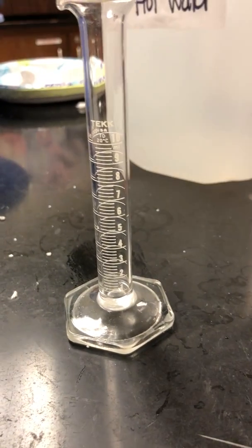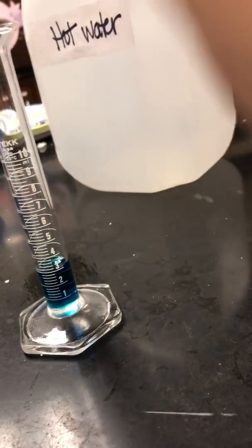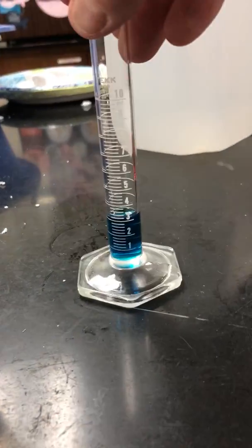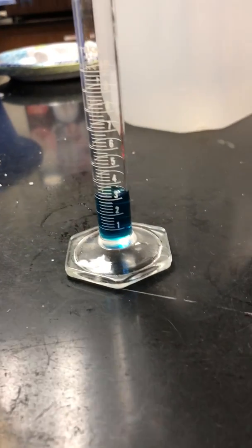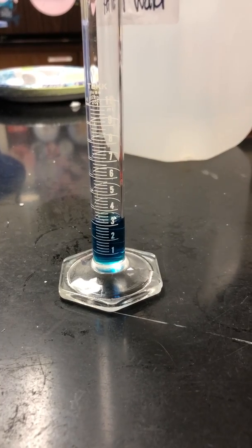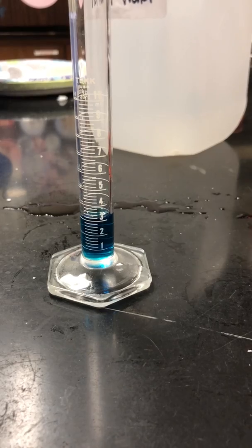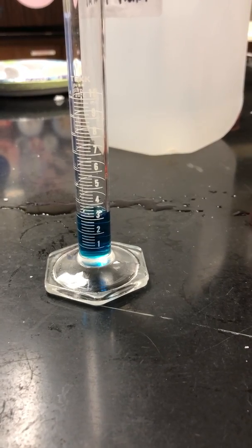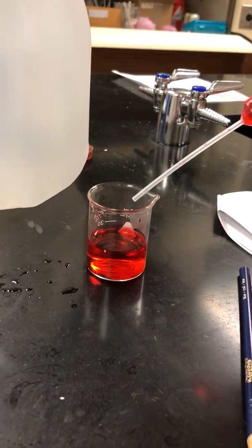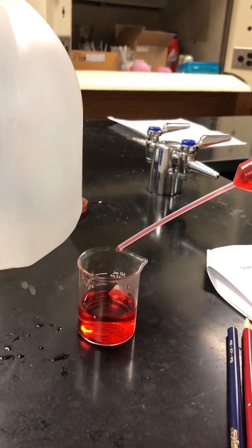All right, pour 3, approximately 3. Good enough for me. There you go, approximately 3 mils of the cold blue water. And now we're going to put approximately 3 mils of this hot water on top. And this is really cool, watch. Oh, it's not doing it anymore. It was, see how it's wanting to come out of the pipette?